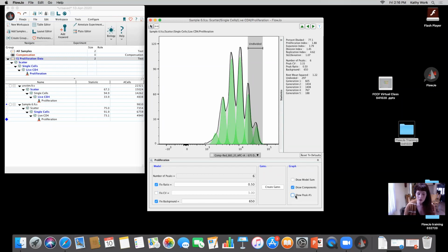Sorry, I think there's a couple of questions that are important before you move on. One of the questions is, why do you have 6 peaks that were chosen rather than 5 that were counted? That's a great question.